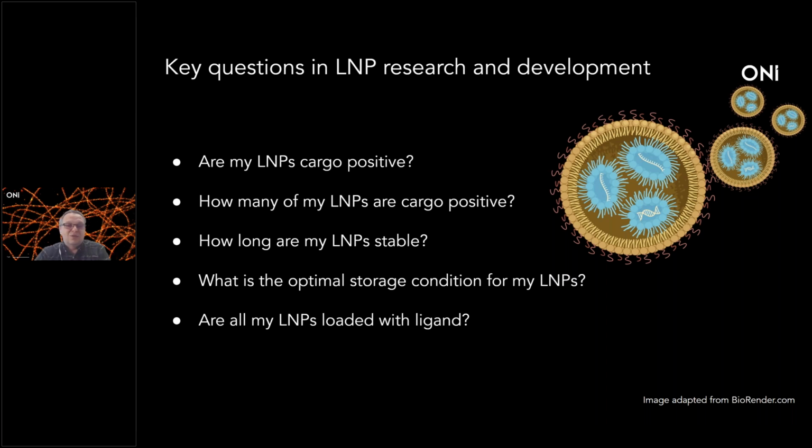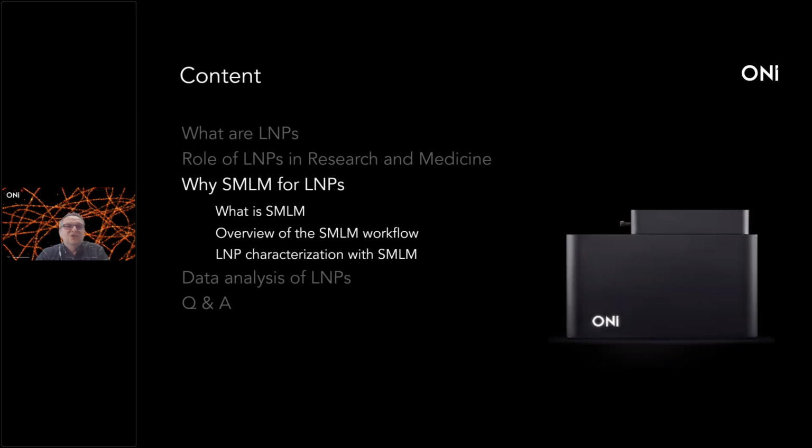So to answer all these questions, I will try to show you that by using single molecule localization microscopy, you are able to answer the majority of these questions when you start to understand your lipid nanoparticles at a basic research level. But before we go there, I would like to give you some insight about single molecule localization microscopy, and why single molecule localization microscopy when you study lipid nanoparticles.